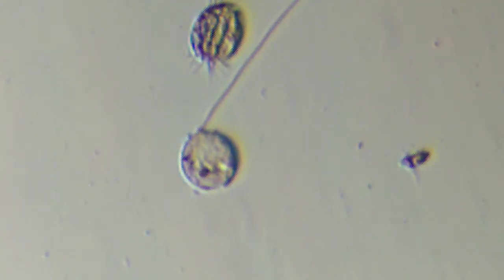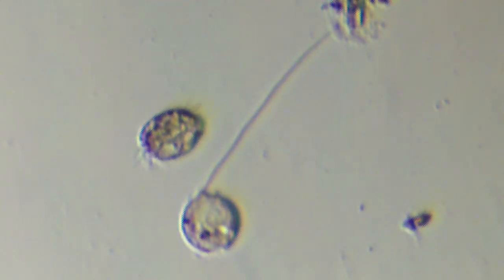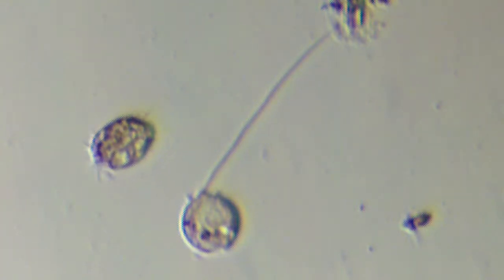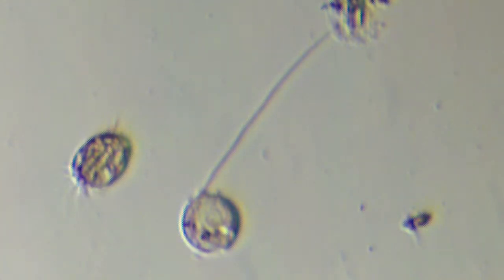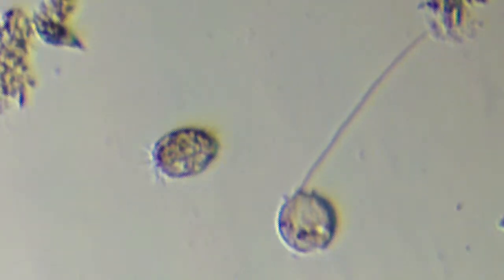And now it's going to interact with this guy, see if it retracts. It's not going to like that. But it's also beating all the cirri. You'll see stuff flying by, little particles flying by, because it's creating a vortex as well.